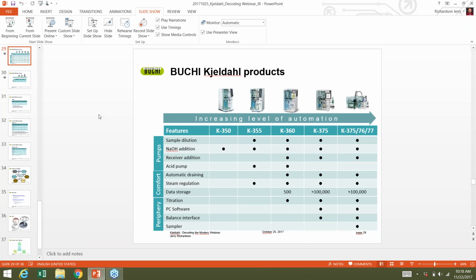It can be a little bit faster if you're using the 6 or the 12 position because of the infrared heating, but realistically you're looking at about 2 hours on a regular basis for the digestion. And for those same 20 samples at 3 minutes apiece, you're again looking at about that same time frame, an hour, maybe 2, to complete the distillation and titration.